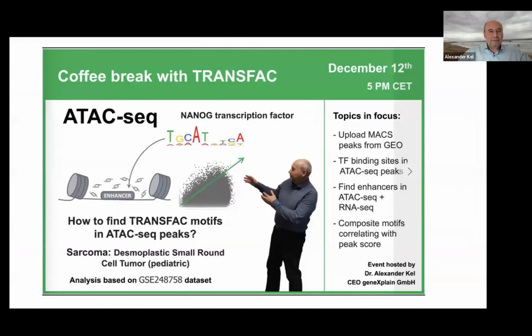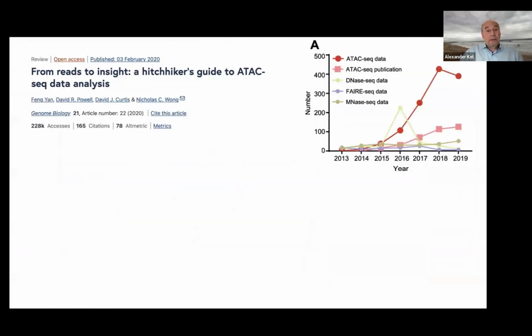So again we'll start from ATAC-seq, what it is. There is a pretty good overview of ATAC-seq data analysis methods in this review, which is already 3 years old, I must say, but it's pretty good. It accumulates a lot of knowledge about the methods which people are using to analyze ATAC-seq data. ATAC-seq is very popular now.